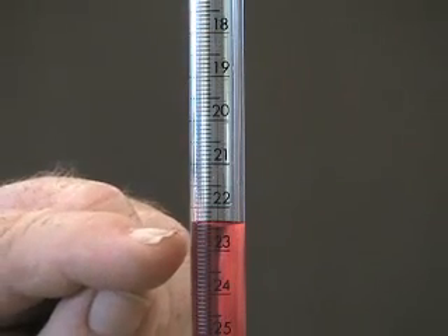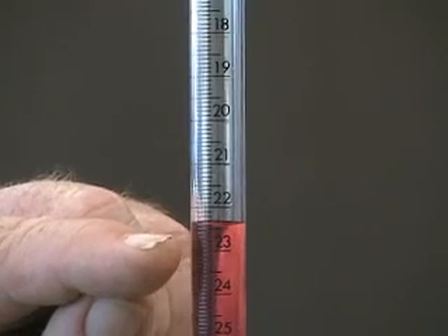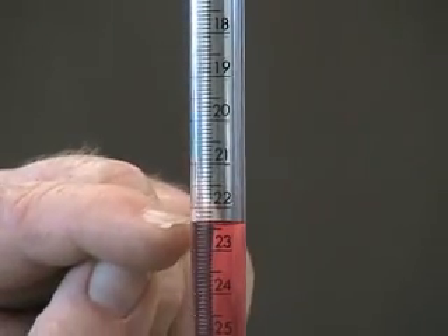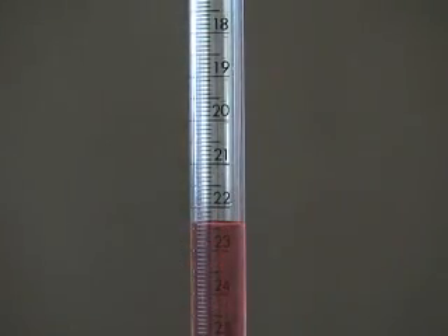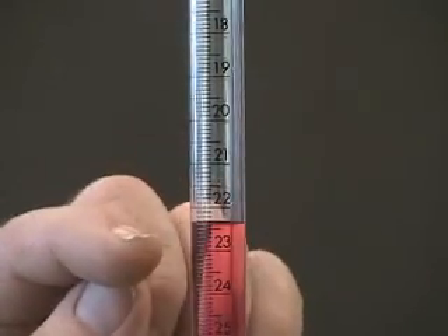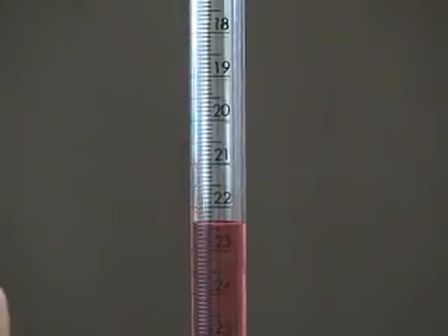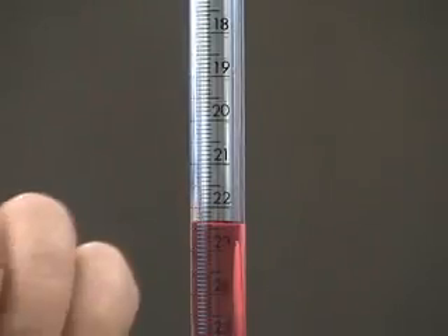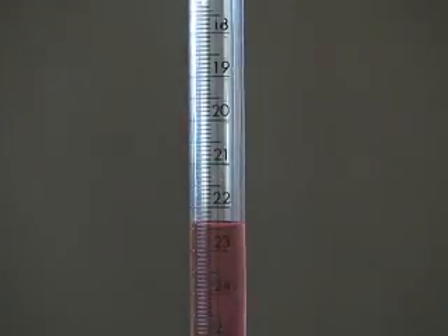The 0.5 milliliter line between 22 and 23 is a longer line. If we look at the liquid in the tube now, we can see that the surface is not completely flat across. That's called the meniscus. Liquids in narrow tubes many times will show you this curved surface. We read liquid volumes at the bottom of the meniscus.